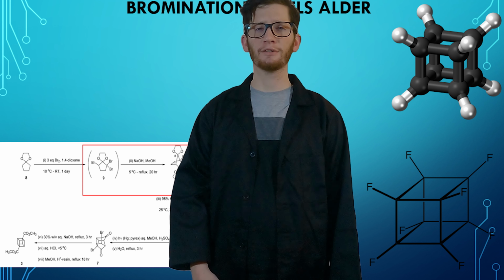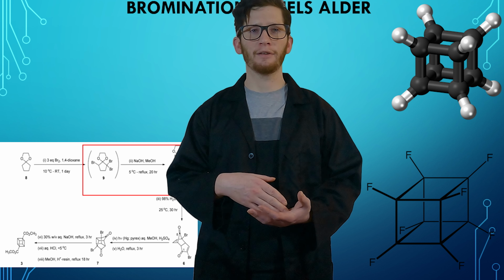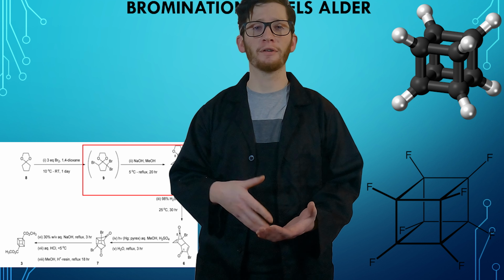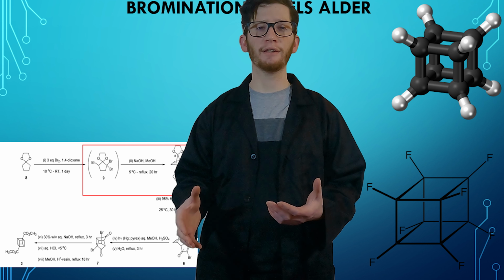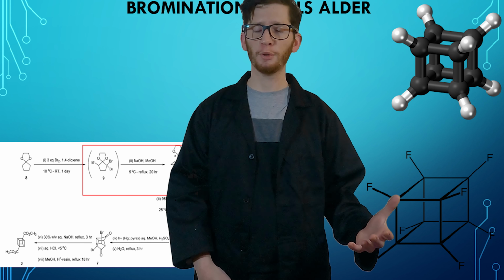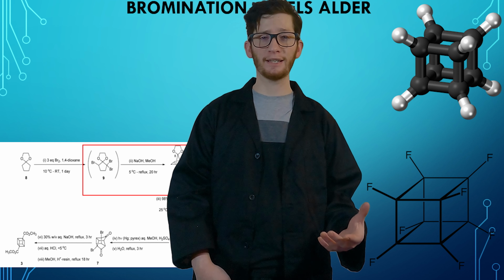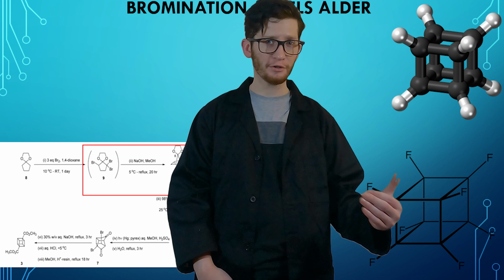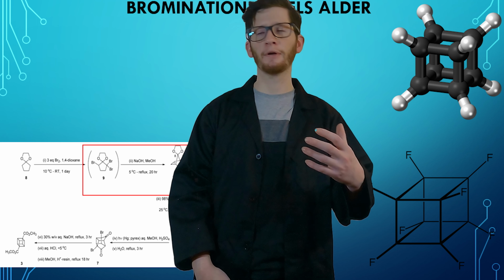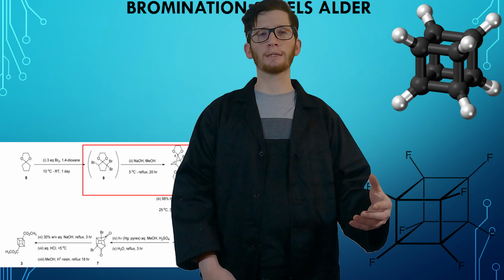The paper doesn't state a degree threshold during the methanolic sodium hydroxide addition, and I was suspicious of that after, of course, we ruined our reaction. So I emailed the author, and yes, they did not let it go above 15 to 20 degrees Celsius during that step. So we are going to take a step back a little bit.